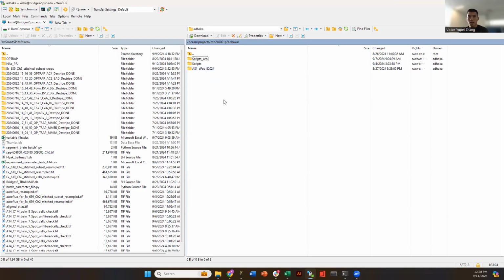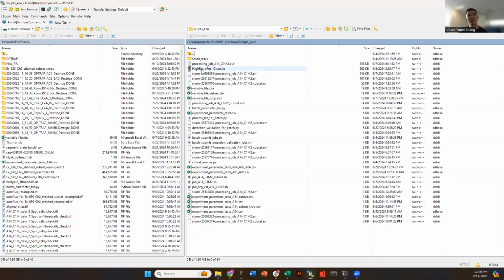Okay, got it. So yeah, that's totally an issue with a trained classifier. If it's an untrained, unsupervised classifier, you don't have to worry about this. But unfortunately, that's not the case. Okay, going back to what you should do on the cluster: you generate this ILP file that has a classifier. You send that to the cluster.